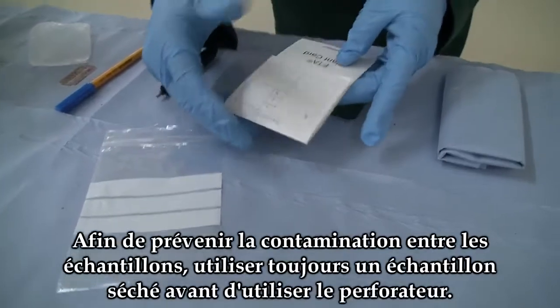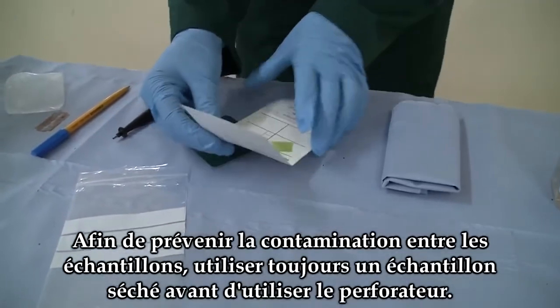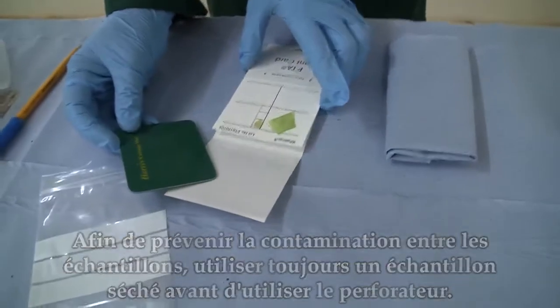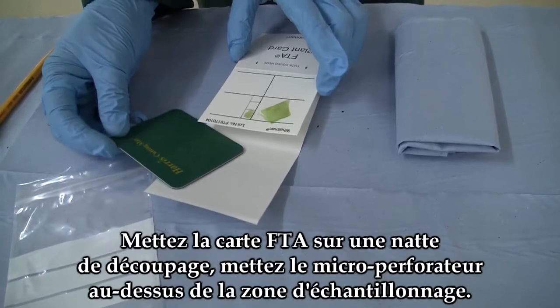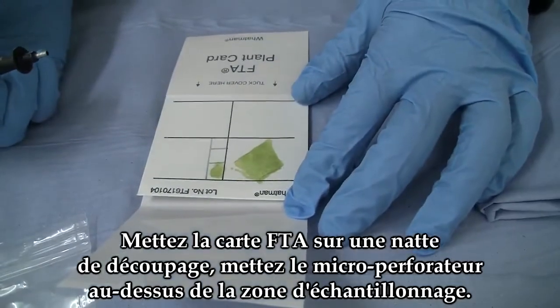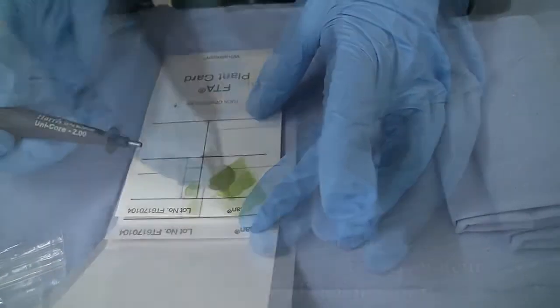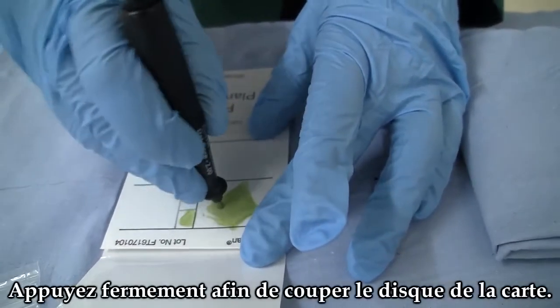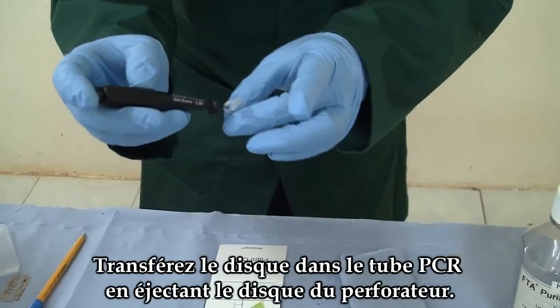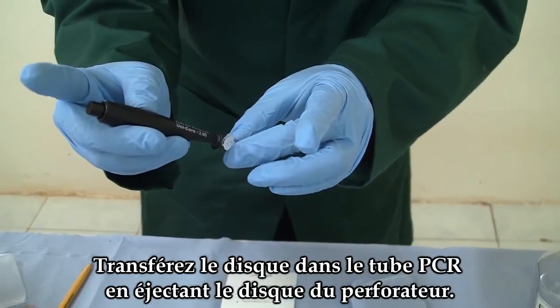As a matter of warning, to prevent carryover between samples, always use a dried sample before taking a punch. Place the FTA card on a cutting mat, place the Harris micro punch over the area to be sampled, and press down firmly to cut the disc out of the card. Transfer the disc into the desired PCR tube by ejecting the disc out of the punch.